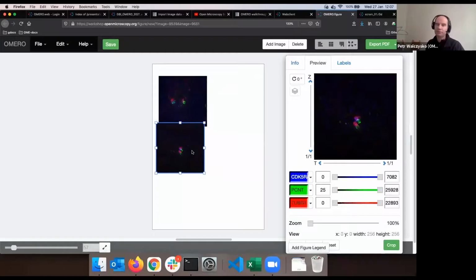This spares you the classical ordeal of a scientist who has to export images as, let's say, JPEGs or PNGs from the software of interest, let's say ZEISS ZEN.